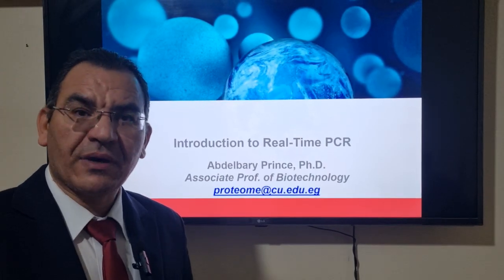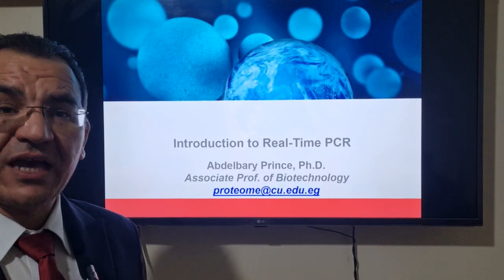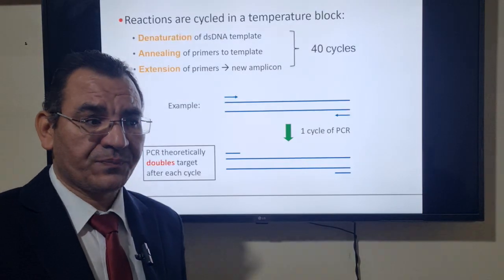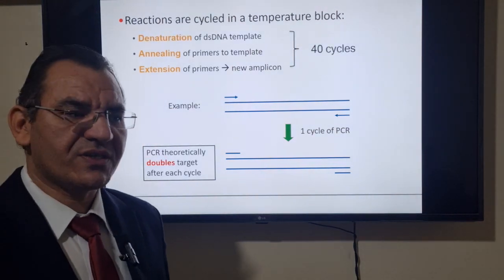Good morning. My name is Abdelbary Prince, Associate Professor of Biotechnology, and I'm here today to talk to you about real-time PCR. How is real-time PCR similar to traditional PCR?